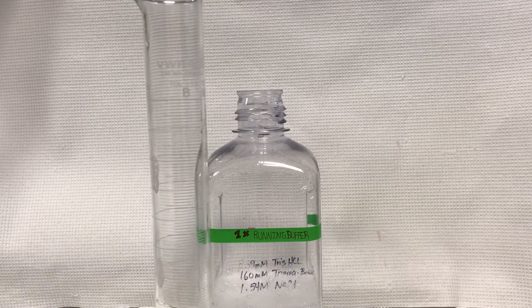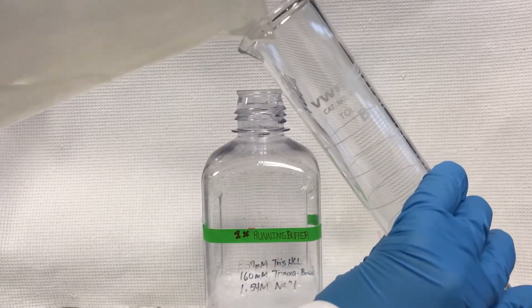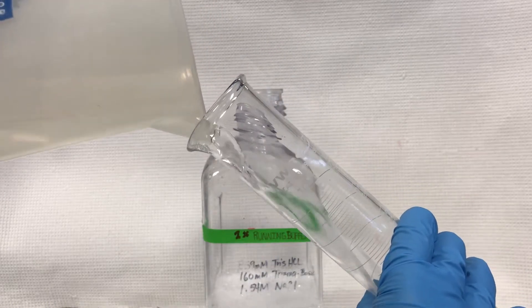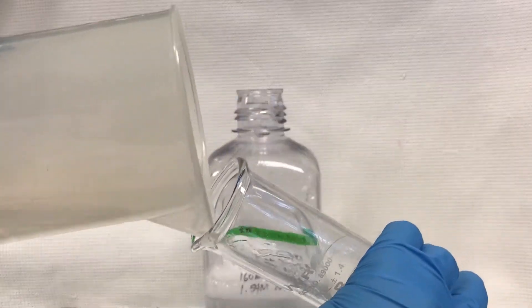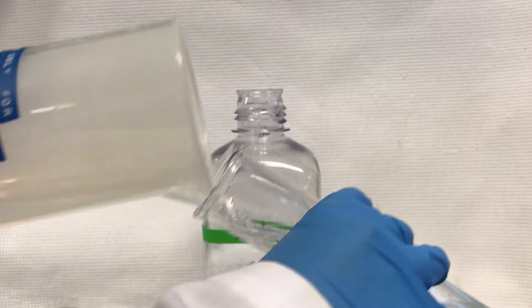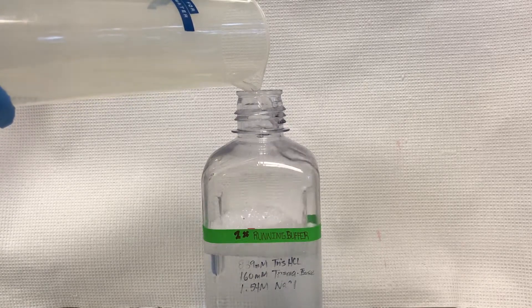Use some of the distilled water to rinse the used graduated cylinder of the 10X running buffer and pour into the buffer bottle until there is no remnants visible. After, pour any remaining distilled water into the bottle.